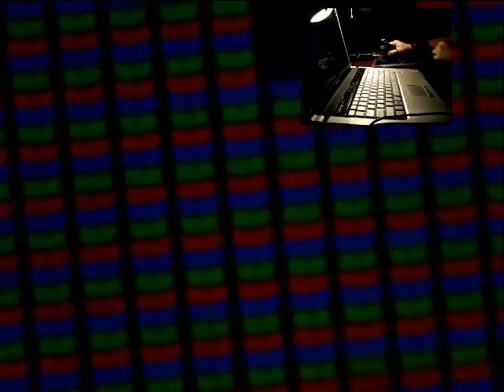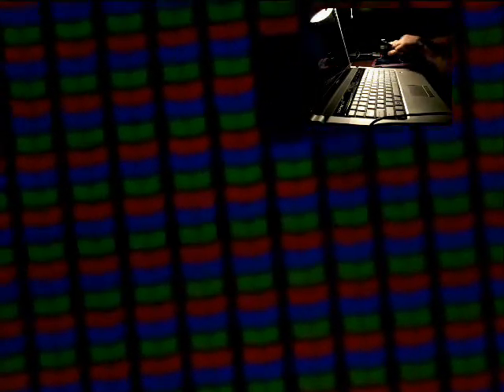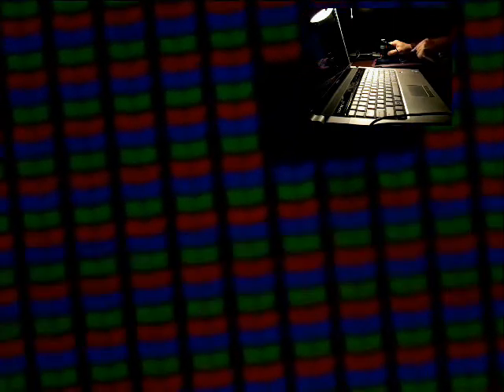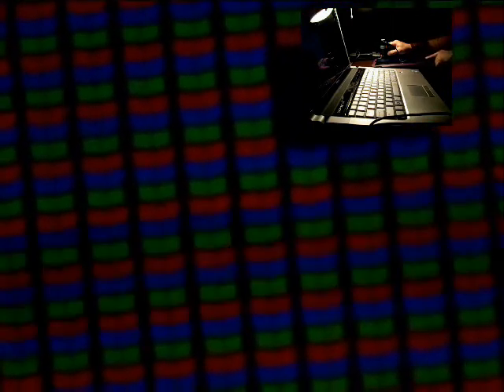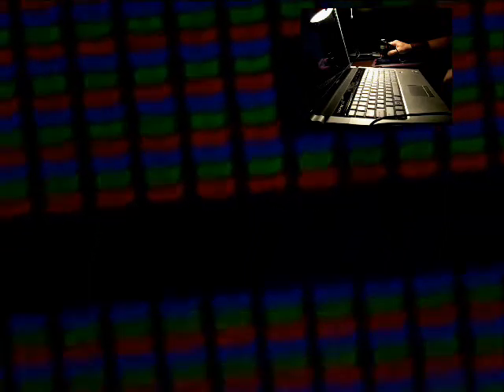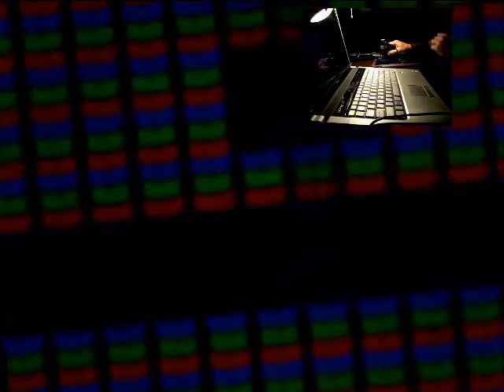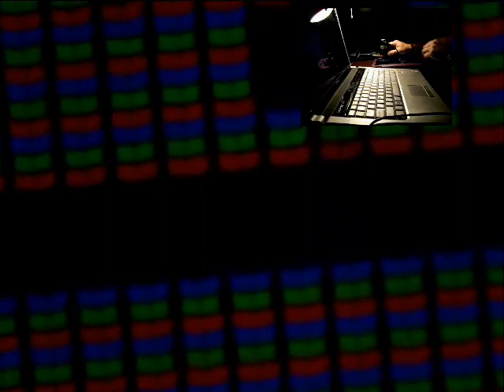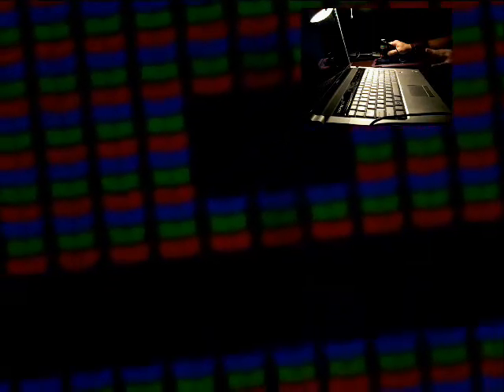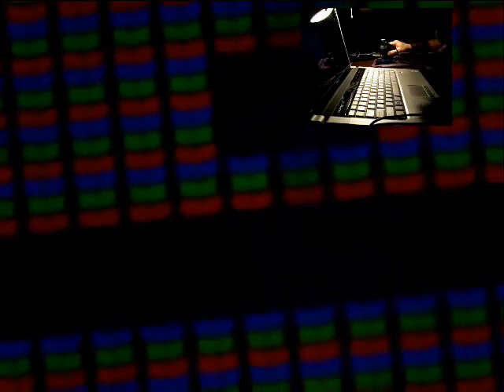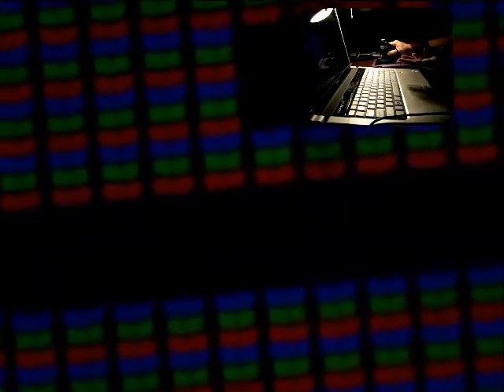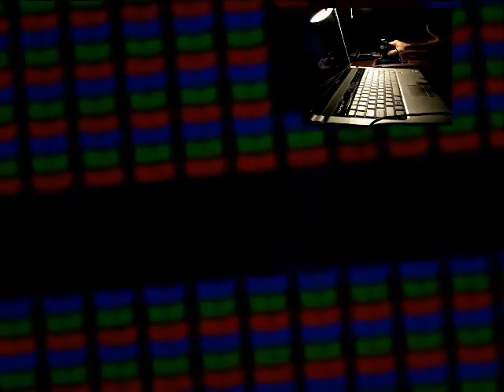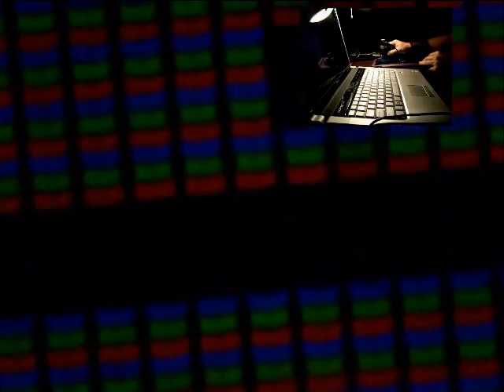In particular, I'm going to try and focus on the period and the cursor, the blinking cursor, which is neat. I'm going to zoom in. Here we go. And that's pretty good focus. Now to get this, I actually had to sand off part of the bottom, like I said, because the pixels are a couple layers down in this tablet. And you can see the cursor, the pixels lighting up, and then shutting down for the cursor. To get all the different colors that you see in the pixels, if it's something blue, they'll just have the blue lit up. And the red and the green will be off. So they mix colors to make everything that we see there.